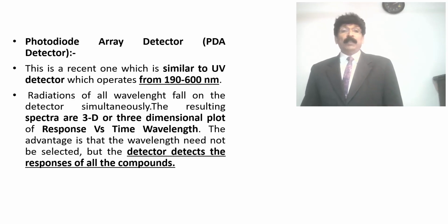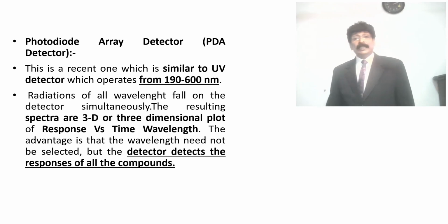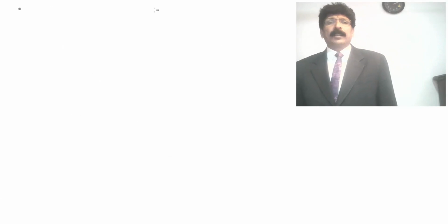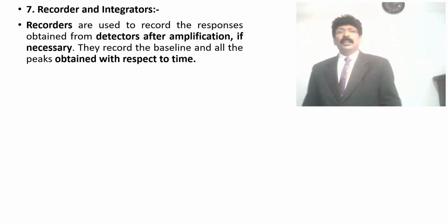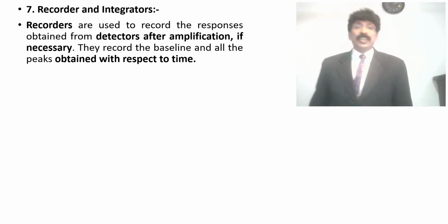The advantage is that the wavelength need not be selected, but the detector detects the response of all the compounds. Very interesting results can be seen. Recorder and integrator: nowadays we are just connected with a computer. Previously, records were made by printing, with detector amplification if necessary.